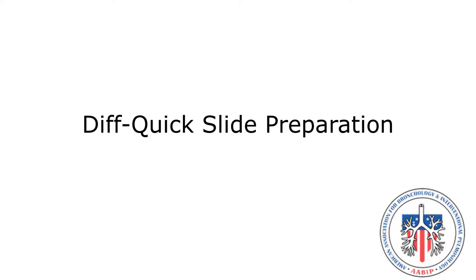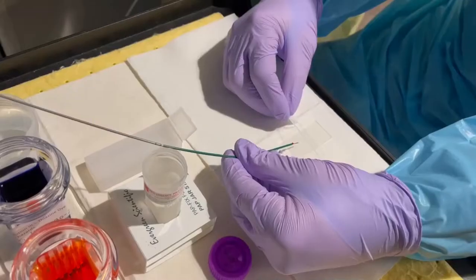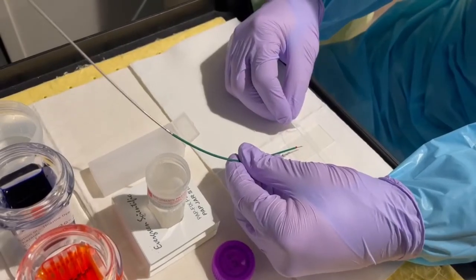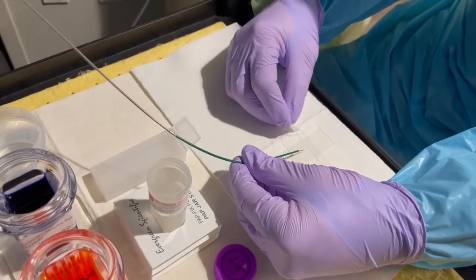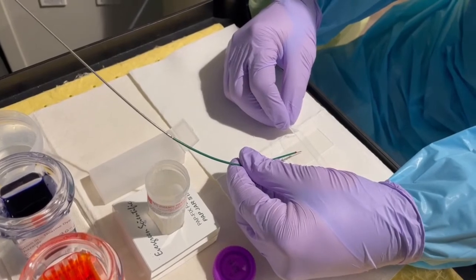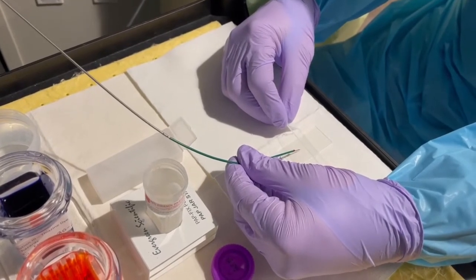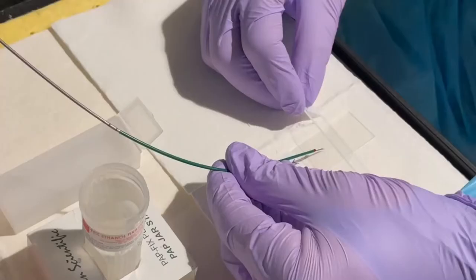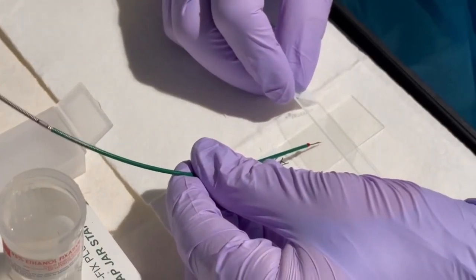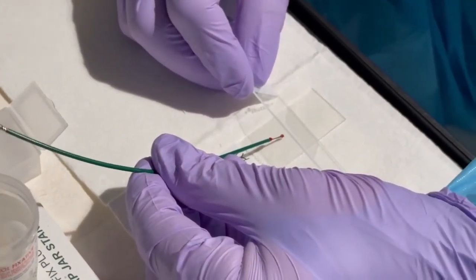This video will demonstrate how to prepare a slide for ROSE using the Diff-Quick method. First, the specimen is transferred to a slide and two smeared slides are made.